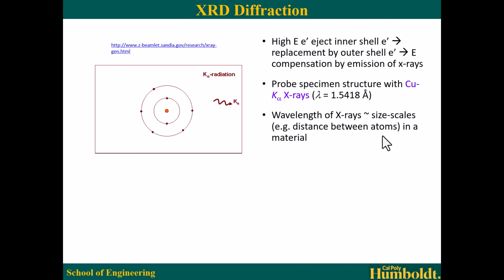So we're going to be using copper alpha radiation in this experiment, 1.542 angstroms. And we need to use that because our lambda has to be on the same order as the distances between the structures that we are trying to investigate. So that is the critical criteria that we have to have. That's effectively the goal here. So we're going to use copper alpha radiation because we're looking at angstrom and nanometer size structures.